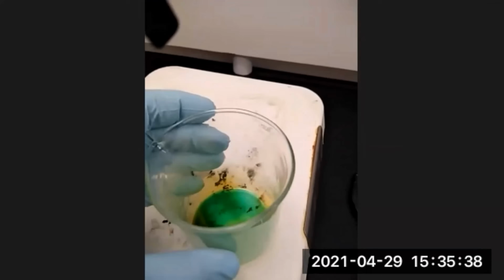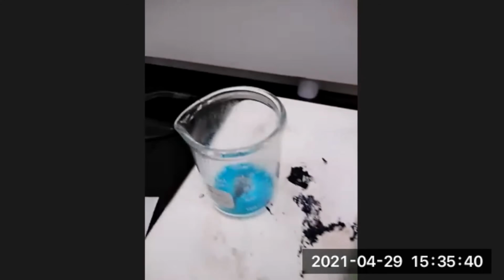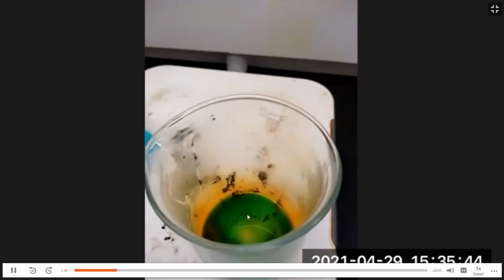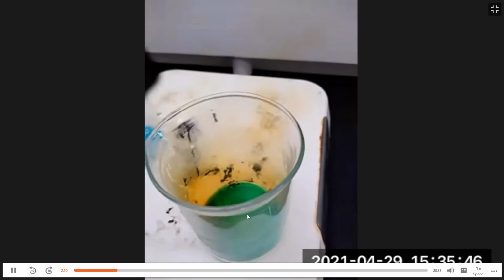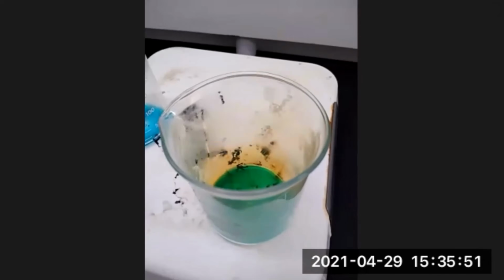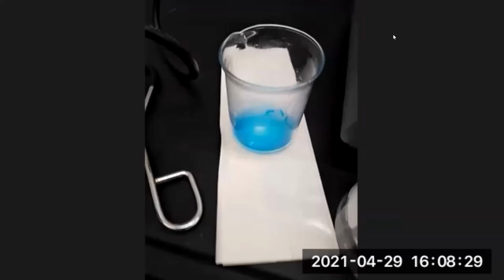So you need to keep reacting the copper until all of it is reacted and it looks like a nice aqua blue solution. That brown gas is the nitrogen dioxide. Now that all the copper has reacted, we're going to add some DI water to the beaker to give it a little bit more volume.